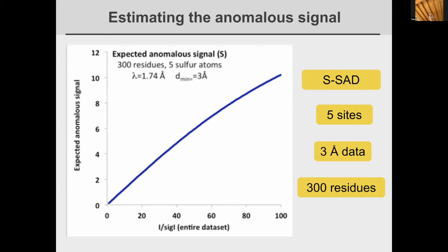To a certain extent you can correct for radiation damage, but to a certain extent you can't. Suppose you collect your crystal way over damaged, and you have 30% radiation damage in your crystal or something like that. Then there's no way you're going to get to an error of 1% in actual estimated error in your data from such a situation. So radiation damage is part of the whole error situation.